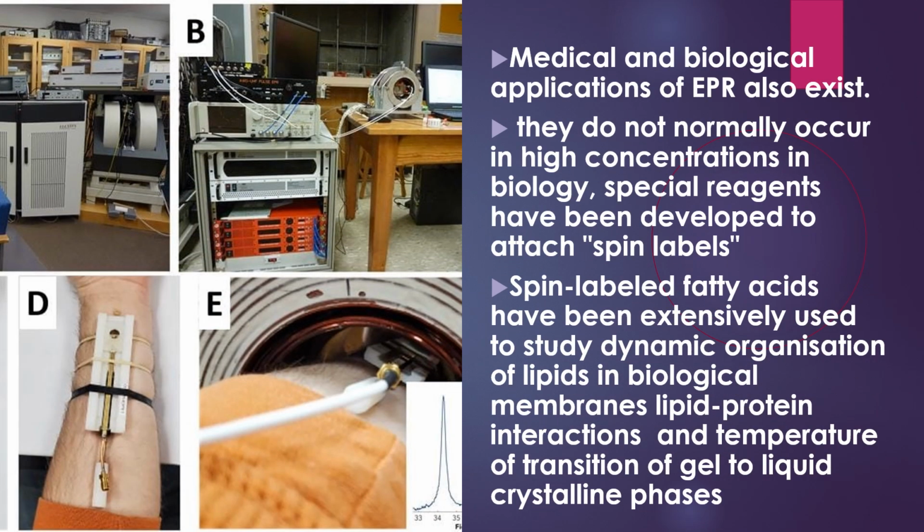Medical and biological applications of ESR also exist. They don't normally occur in high concentrations in biology. Special reagents have been developed to attach spin labels. Spin-labeled fatty acids have been extensively used to study dynamic organizations of lipids in biological membranes, lipid-protein interaction, and temperature of transition of gel to liquid crystalline phases.